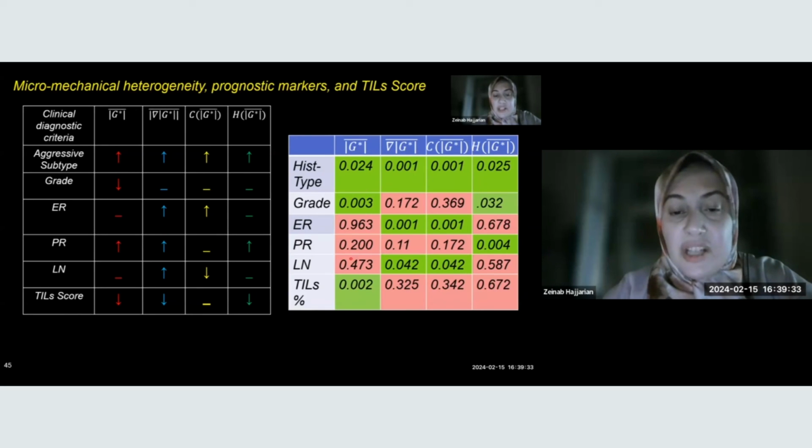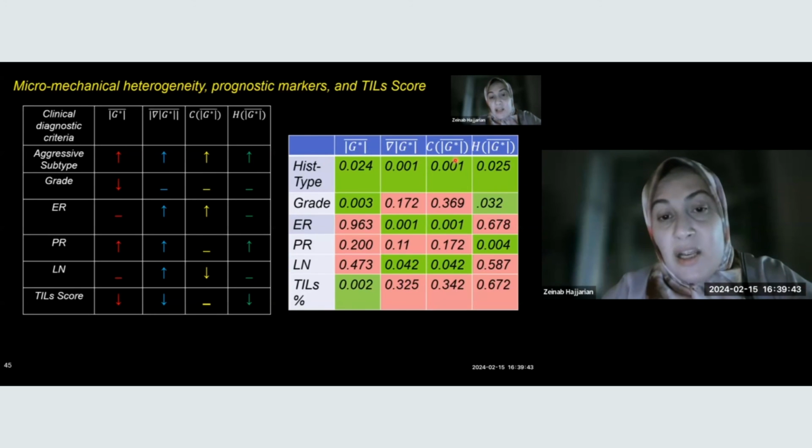And this is the observation that we make. These are the trends that are actually significant, which is pretty interesting. So this basically tells us that some of these metrics can differentiate tumors of different grades and can serve as common denominators of aggression among different criteria that are developed to reduce the complexity of the disease, but then in turn have increased the heterogeneity.